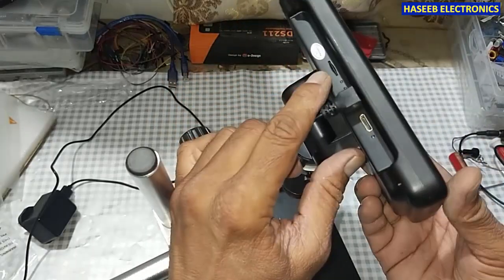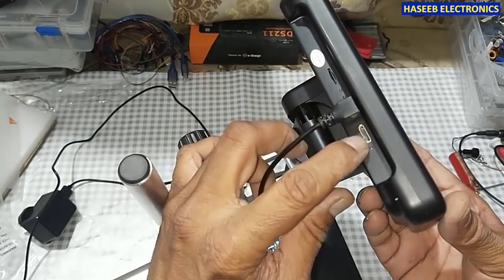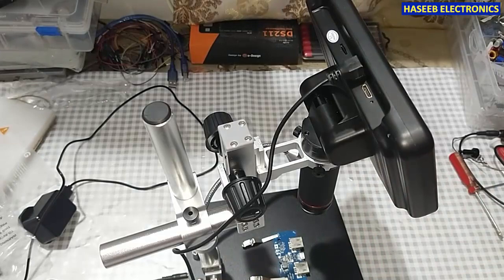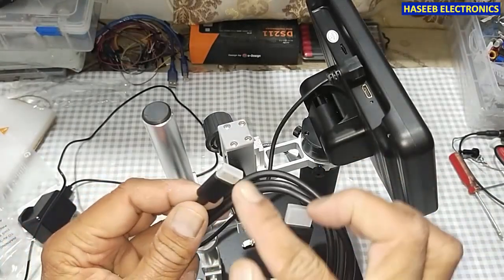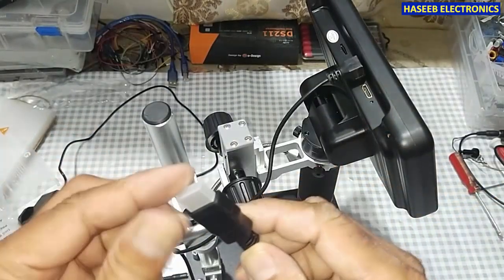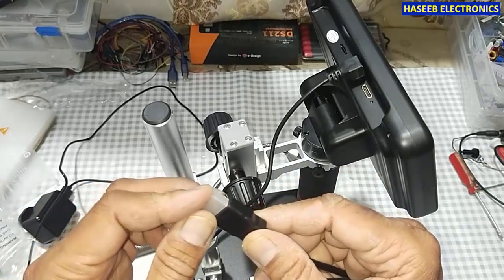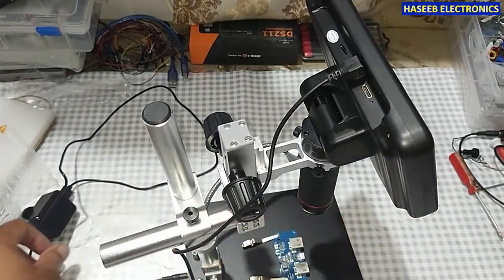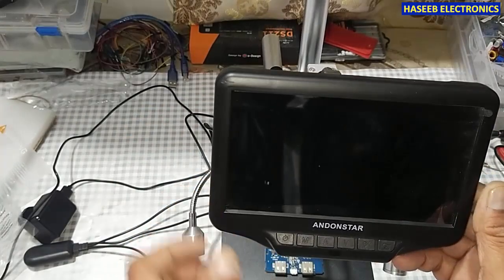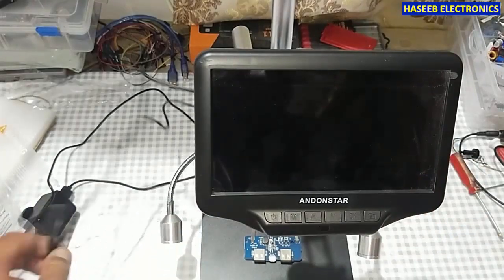Here is the micro SD card slot — we can install a memory card to record videos and take pictures. Here is the mini HDMI cable; we can take video output on this mini HDMI cable and display on any HDMI-based display such as a TV, LCD, or LED monitor. Here we have many control buttons including a power button and menu button.